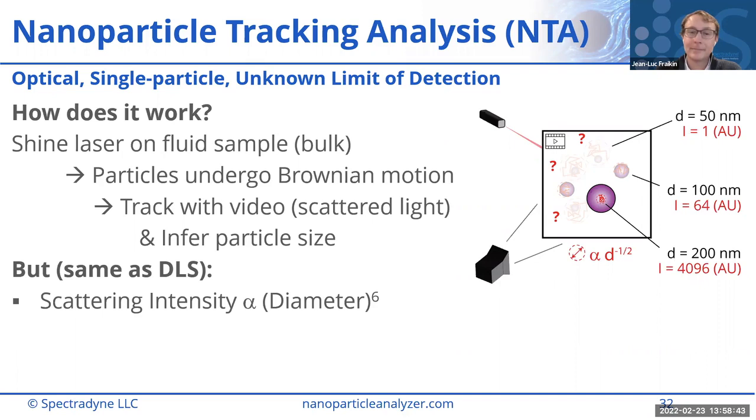Thank you for the webinar. So I wondered if I would like to measure EVs with a particle size of 100 nanometers, which cartridge size would you recommend? So is it better to go with C300 or the C400 cartridge? If it's really 100 nanometers, I would recommend the C400s. They're just more forgiving from a perspective of the wetting agents and things like that. So they're just generally easier, but either one will work.